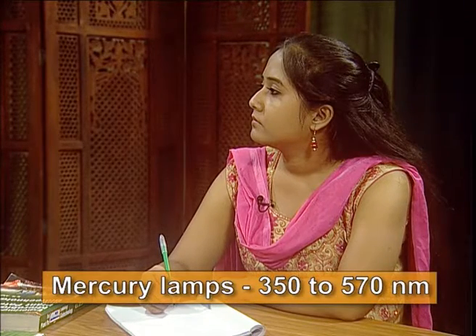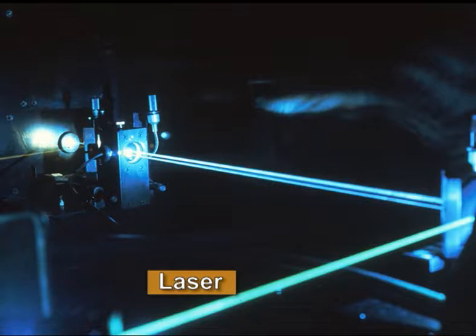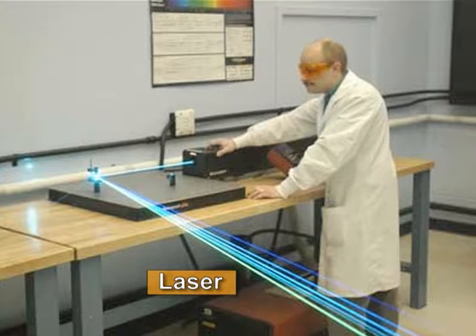A fluorescent microscope uses xenon or mercury arc lamp. The reason for using this is we can obtain specific bands of wavelength from these lamps. For example, for mercury arc lamp, we can obtain anything from around 350 to around 570 nanometers. However, in modern day, for specific illumination, what people use are lasers. The importance of using lasers is that I can have a fixed line or particular bands or particular spectral wavelength coming through to illuminate the specimen.